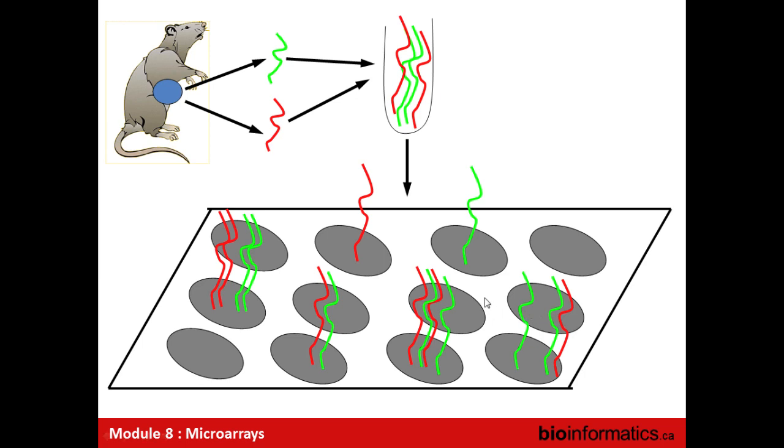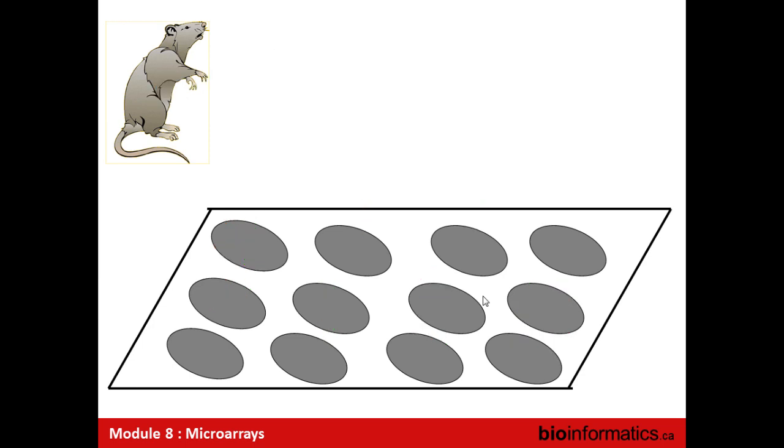With two-color arrays, you have the advantage of being able to do this additional quality control check, where you can take a look at homotypic error rates, which is very, very useful. On the other hand, having two dyes is inherently bringing in additional noise and complexity. Single-color arrays are sometimes thought to be more simple. Now let's stay along the two-color array design.